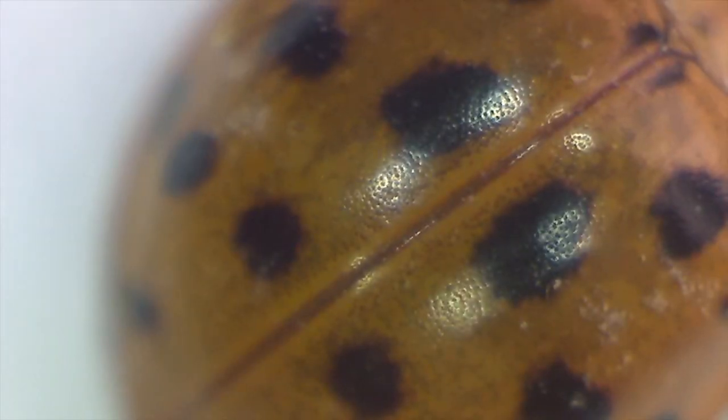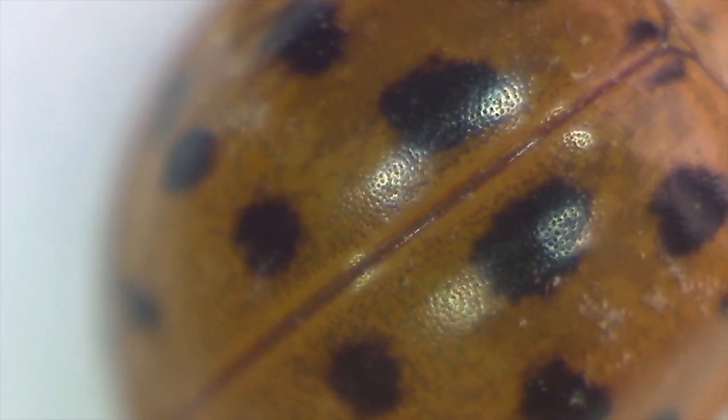Here we are from the top now, its head, and then the shell underneath which are its wings that are hidden away in its spots. And you can see on the shell that there's some structure there, it's slightly dimpled. If we go to a high magnification, you can have a look at that in a bit more detail. As you can see, the surface almost looks like the surface of an orange.